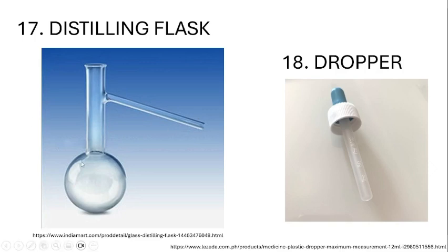Say we have a substance, usually alcohol, and then there is heat being applied, and there is a thermometer to keep watch of its temperature, attached to a cork. Once evaporation starts, the vapors will pass through the side arm connected to the condenser and so on.